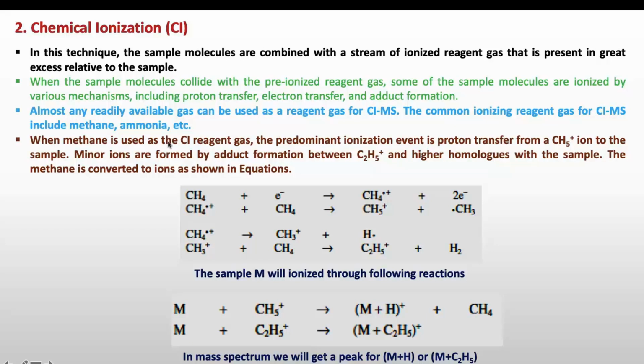When methane is used in the chemical ionization chamber, the predominant ionization event is proton transfer from a CH5+ ion to the sample. So let's see how this CH5+ forms. First, methane loses an electron and converts to the CH4 radical cation. Now this radical cation collides with another molecule of methane and converts it to CH5+. This CH5+ is important to ionize the sample molecules. Another reaction can happen here: this CH4 radical cation can dissociate to CH3+ and an H radical. Now this CH3+ will collide with another molecule of CH4 and convert it to C2H5+.